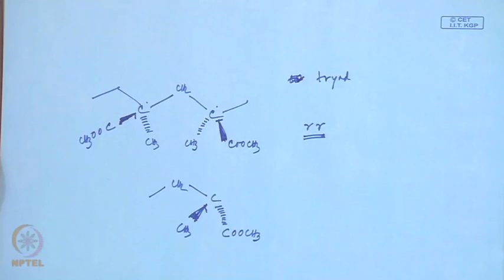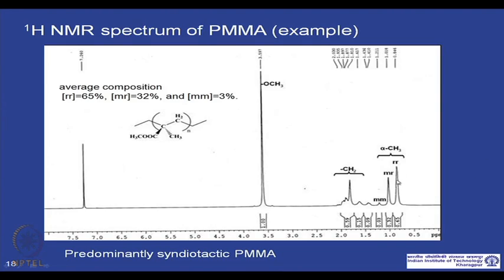if you go back and look at the NMR spectra on the computer screen, this RR is the maximum compared to the other two signals.